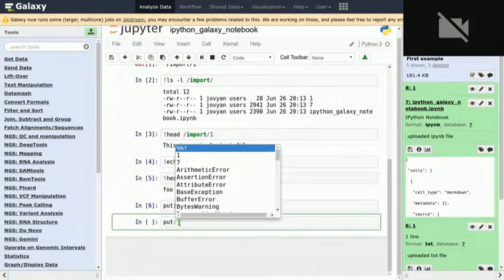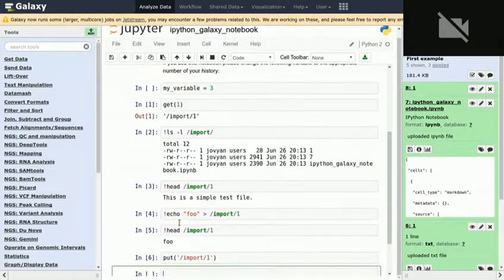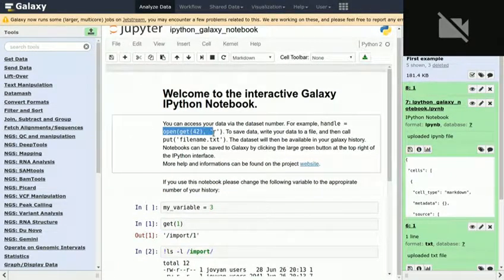When you did the get, could you just type into a variable right off the bat? Say like x equals get 1, and then when I did like an open in pandas or something, I probably said x. So you mean something like that? Oh, just the right side. Yeah. So you can do it because what get returns is just a string of your path. So you can right away open it or parse it.